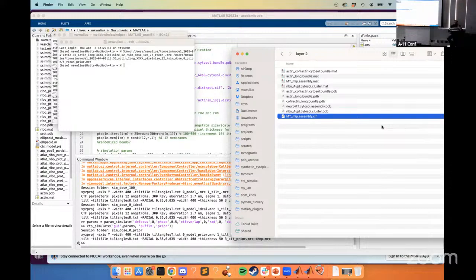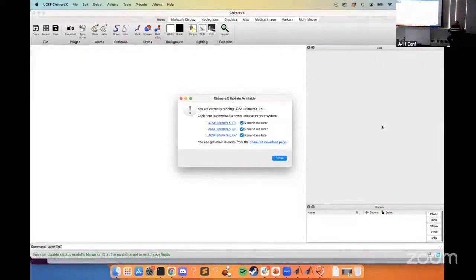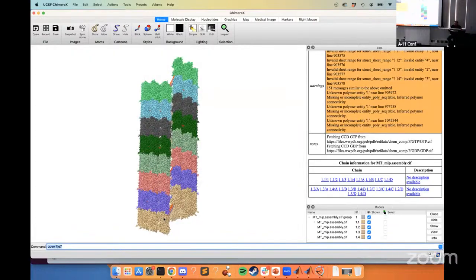We've been using relatively short segments of microtubules, maybe 30 or 40 nanometers long, maybe 40, 50. This is what we've been using for everything right here. This is probably the unit, right?